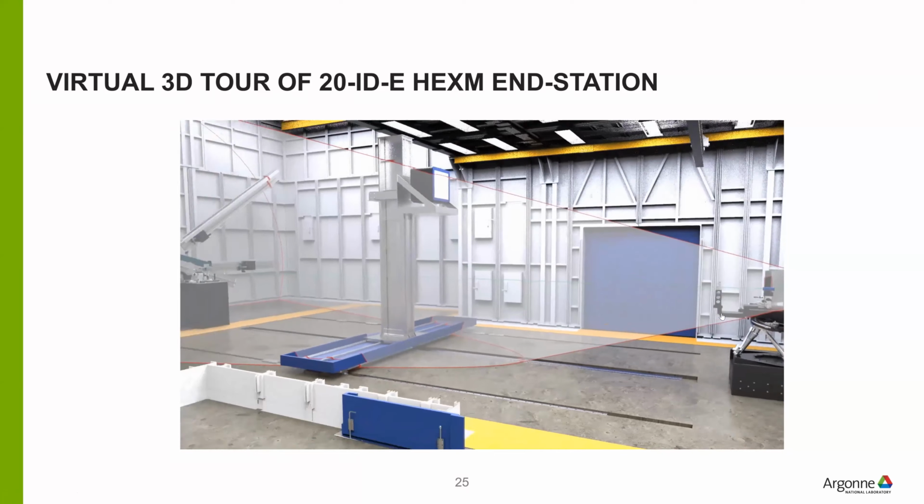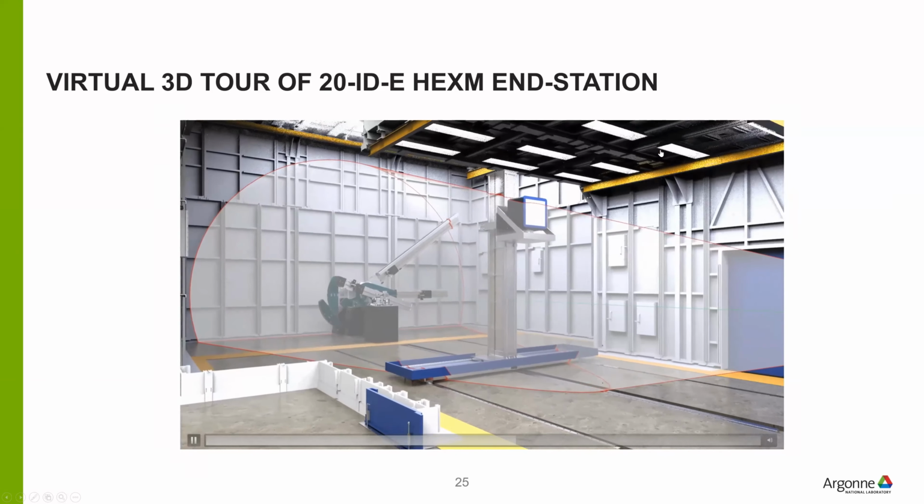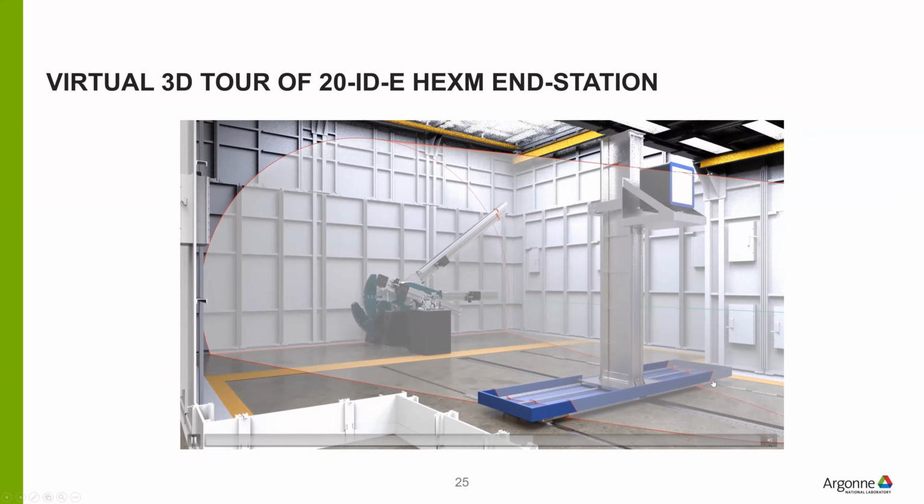Going more downstream, like I mentioned before, our hutch is staggered like so, a combination of two volumes, so that we capture one angstrom peaks at 40 keV at the outer periphery of this space.